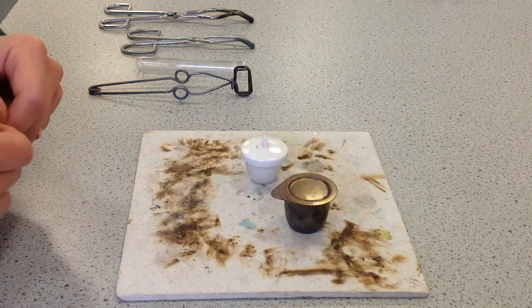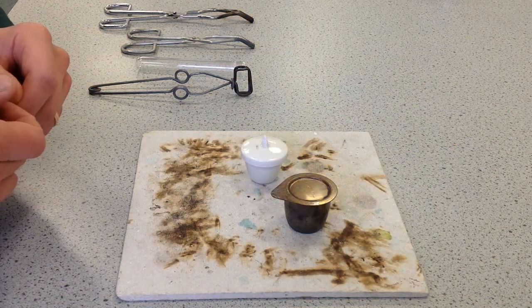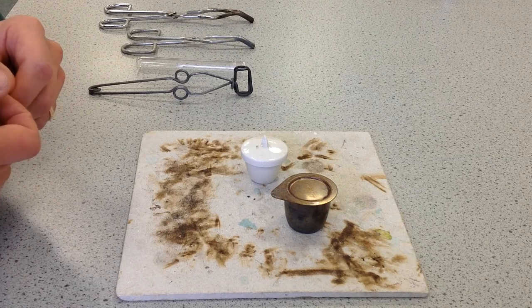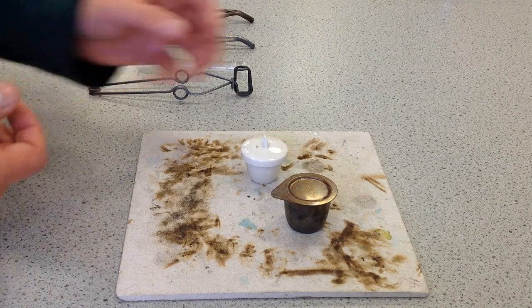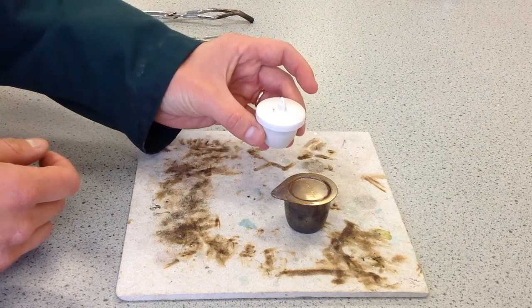What is a crucible, then, to begin with? Crucibles are containers used to heat substances to a very high temperature. And they come in two flavours, as we can see here. This first one, an old-fashioned type, is actually made of porcelain.